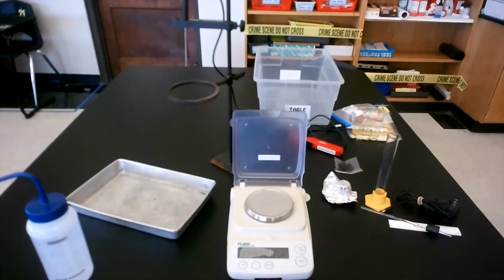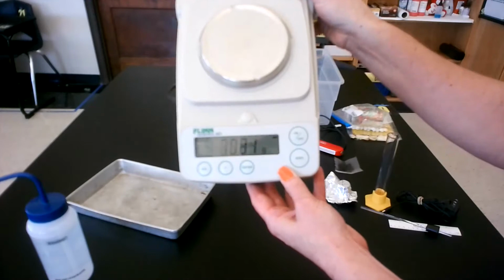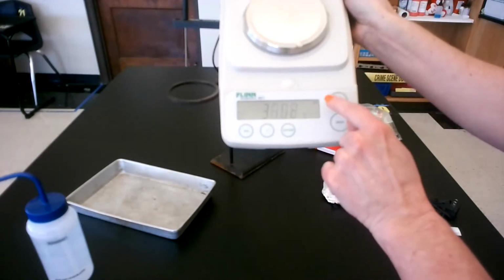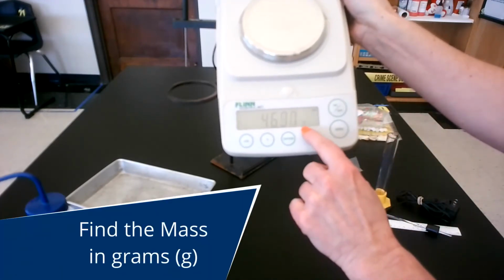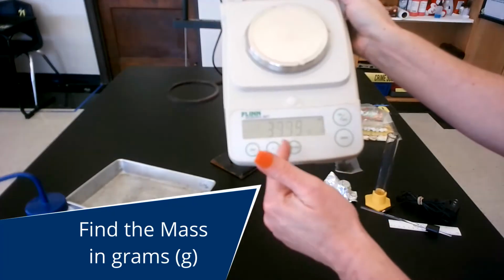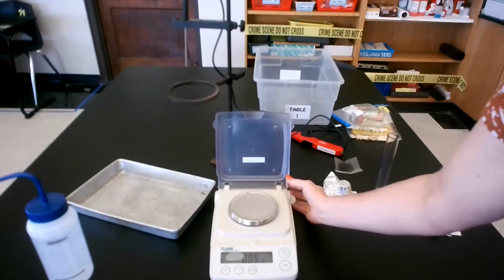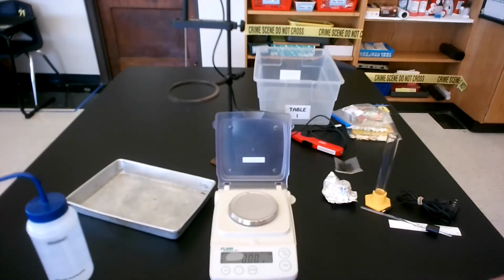So I'm going to turn it on, and you've got to give it a second. It's going to go through and do its calibration. Okay, you're going to have in the upper right a little battery symbol, and then it should be G for grams. That's going to be moving a lot since I am picking it up. So when you get to that, make sure it's weighing in grams, then I'm going to zero it if it's not already zeroed out. So it should be calibrated.